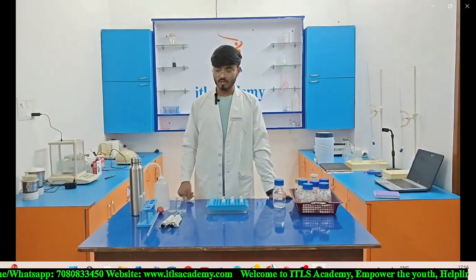So this is the rinse water after 10 minutes. Now what we need to do, we need to transfer 1.5 milliliters of this solution into every Eppendorf.